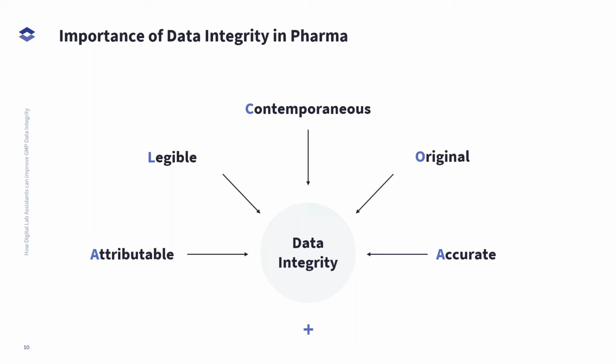I personally understand data always being at the center of a triangle, which consists of confidentiality, integrity, and availability. And the key to that is data integrity. And this is described as the ALCOA principle. And most people don't mix it up with Aluminium Corporation of America. So this is actually something different. And it always starts with attributable. So it clearly indicates who recorded the data or performed the activity, what is being signed, and when it's being dated. And you exactly know who wrote the document and the record and when.